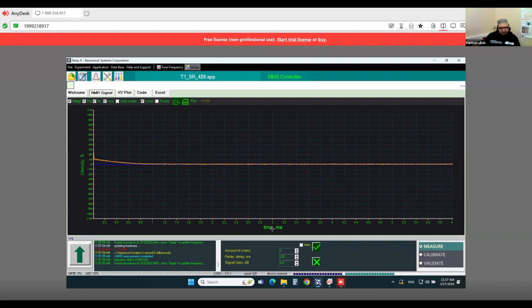So this depends upon the sample. If the sample has more hydrogen, more protons, you have good results. We are using the hydrogen probe, that's why we are detecting these materials. This sample has less proton, less hydrogen, so you will see the noise and signal in your result.